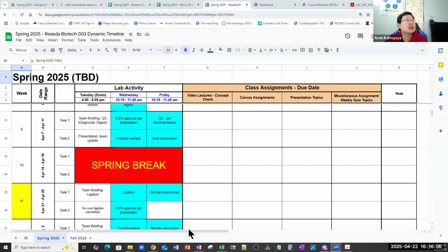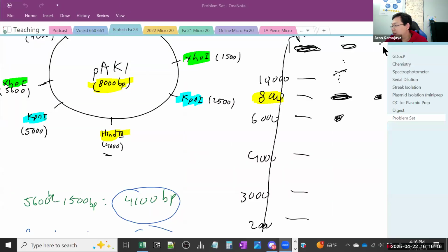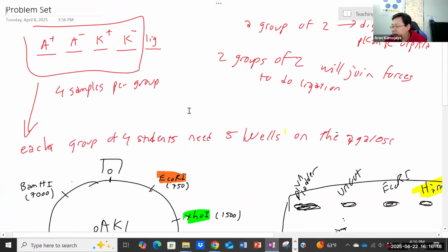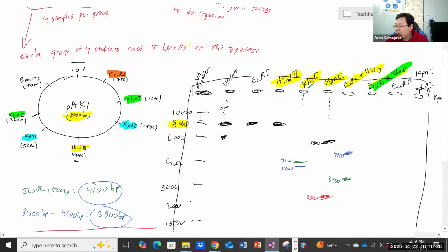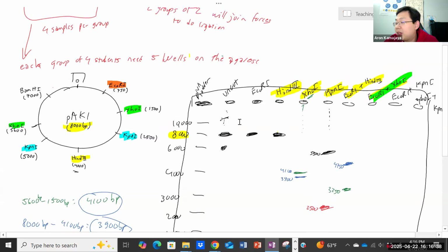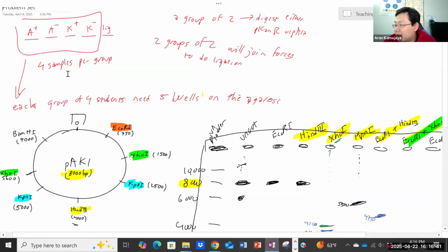So I think last time we went through some intellectual exercise. Let me share this one. Remember this one? We did this before spring break, right? We talked about what you expect to see, and then I gave you a problem set that's going to be in your second questionnaire. So I hope you all still remember how to do this. This week you are going to run the gel for your digest. So something like this.